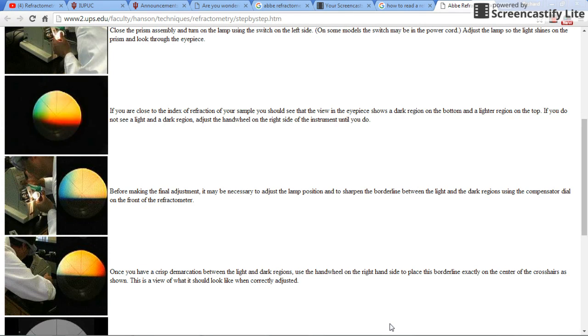I'll have to give you some information about compounds, but really most of the material you're going to need is off of page 96 in the book. 3 things are listed about the compounds: the boiling point, the density, and something called the refractive index.